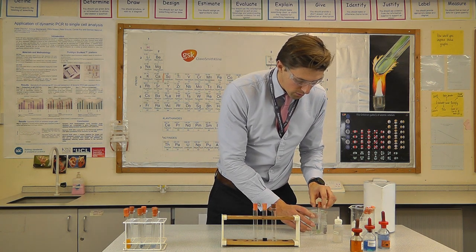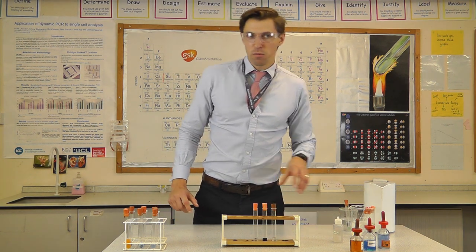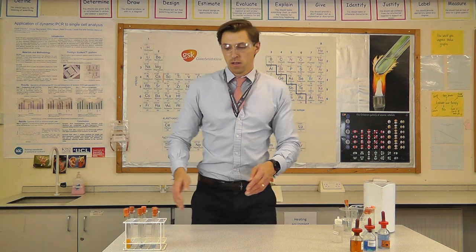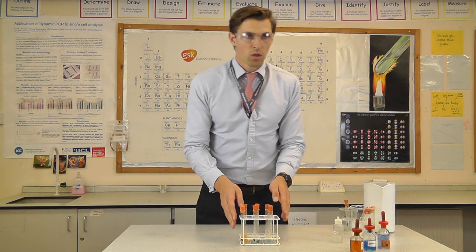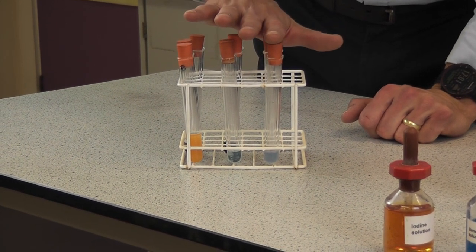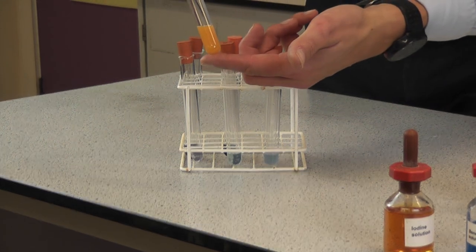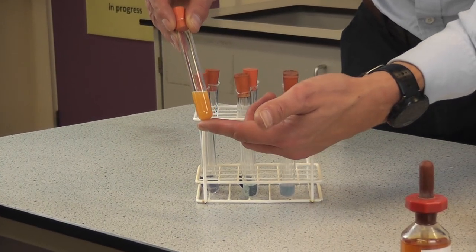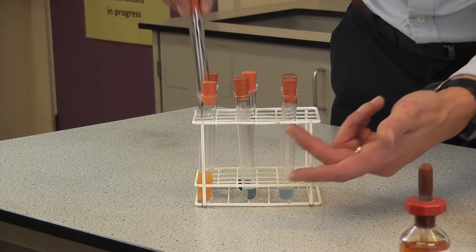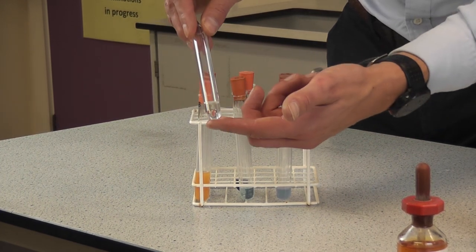We're going to leave our biscuit in the beaker for the Benedict solution and, in true Blue Peter fashion, here are some I prepared earlier. Looking at the biscuit results: we've got a lovely orange colour indicating the definite presence of glucose, a negative result for proteins, a positive result for starch, and a negative result for fats.